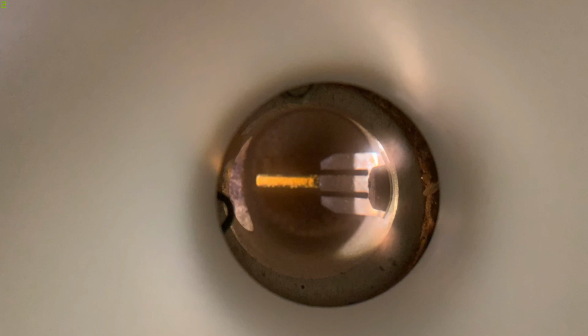and a yield of 94.25%. As a result of the synthesis, observed by the chemical nature, the Schiff base compound was dissolved with sodium hydroxide, added drop by drop, causing complete dissolution.